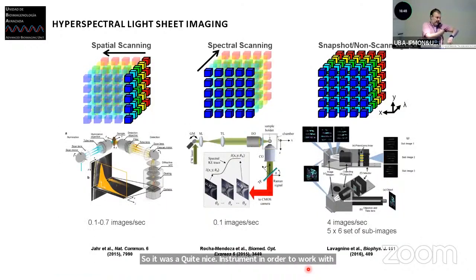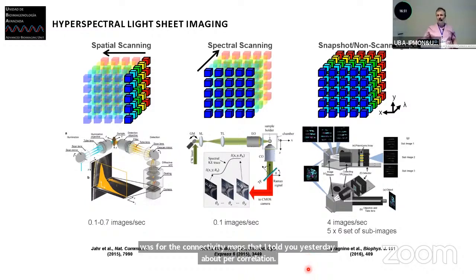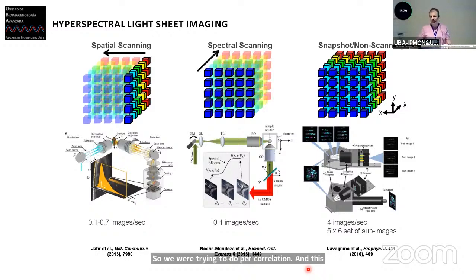But in the LFD, usually everything needs to be thought of with the spectroscopy at the side. And the big reason why we built this microscope was for the connectivity maps that I told you about yesterday, about pair correlation. So we were trying to do pair correlation, and this is another work that I more or less showed you with the concept with the TIRF. But the first experiment of the pair correlation, and all the papers that show the potential of the connectivity map, were with this microscope. But the next thing that we wanted to do is hyperspectral imaging.